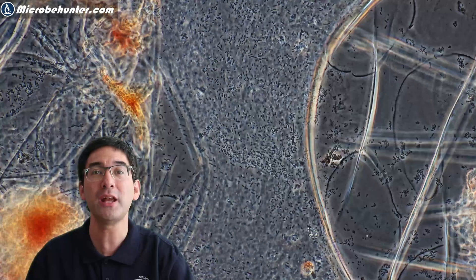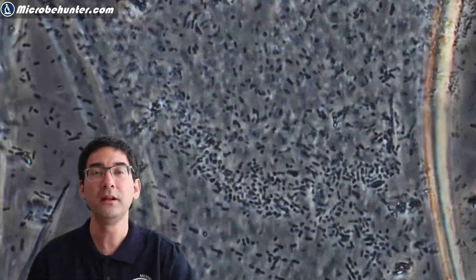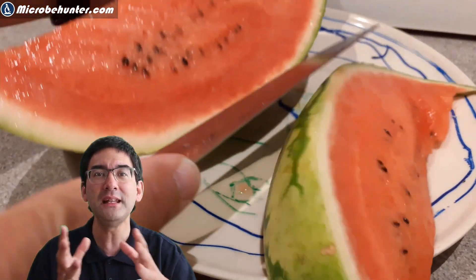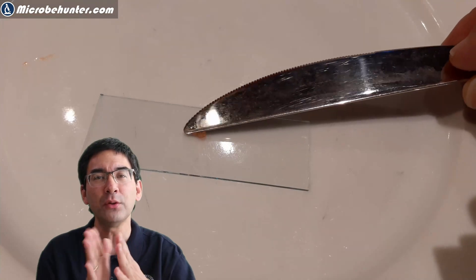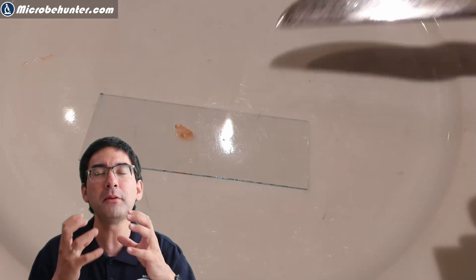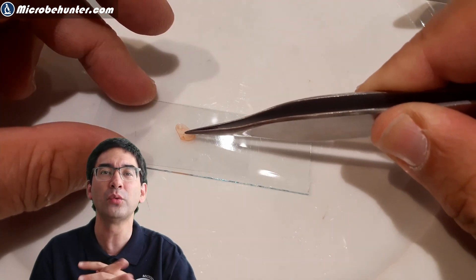Bacteria from the air are able to settle on the cut surface and multiply, because the watermelon is very nutritious. You can see those little small dots streaming — these are most likely bacteria with the right shape, appearance, and size. The watermelon was already a week old, and even kept in the refrigerator it no longer looked quite fresh. On the soft outside, bacteria had likely already started to break down the tissue.